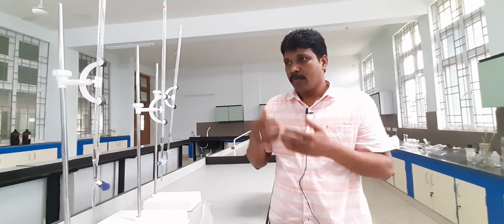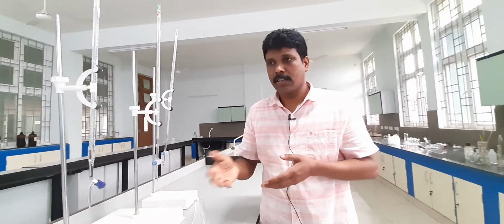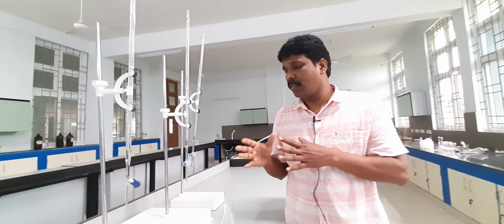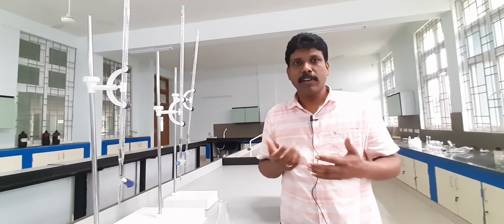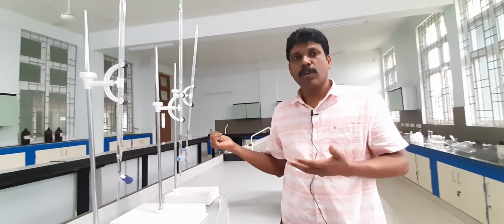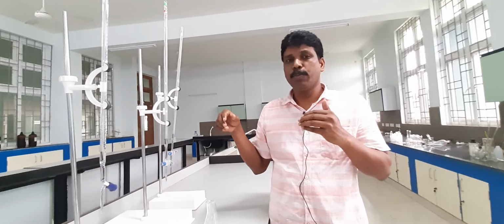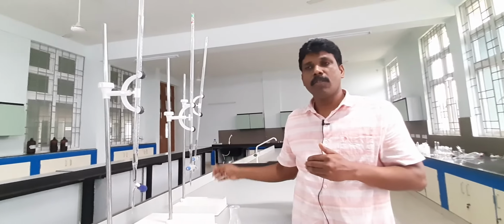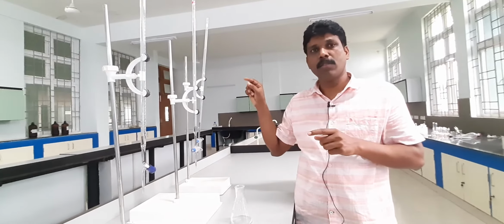Okay, and we have to prepare approximately 12 or 13 different mixtures, as you can see in the table. We have to prepare approximately 12 mixtures of acetic acid and chloroform solutions, like 19 ml of acetic acid and 1 ml of chloroform, so the total volume is 20 ml. Then the next composition would be 18 ml of acetic acid and 2 ml of chloroform. Here you can see that the total volume is 20 ml.